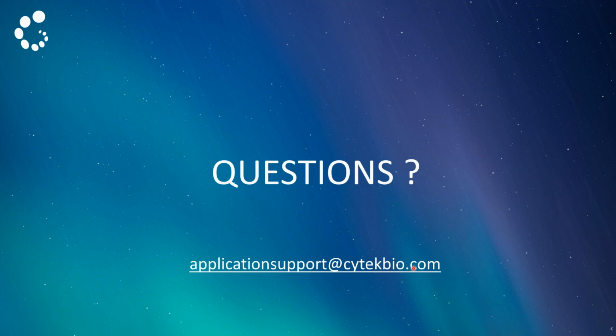Fabulous. Thanks a lot for that interesting seminar, Maria. Now let's move on to the question and answer session. So the first question we've got here for you, Maria, is: if we create our own settings, would it be a good idea to define them as delta from the CAS? So rather than using the same gains every time, define a gain as, say, -20 from that day's CAS.